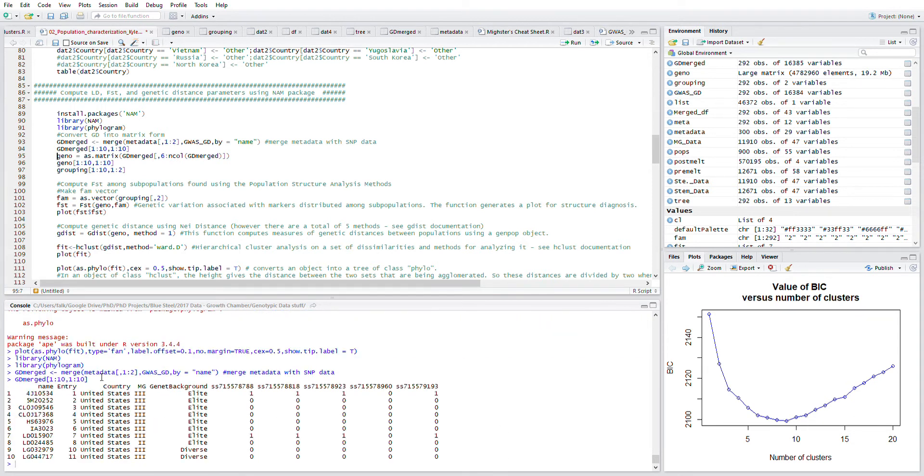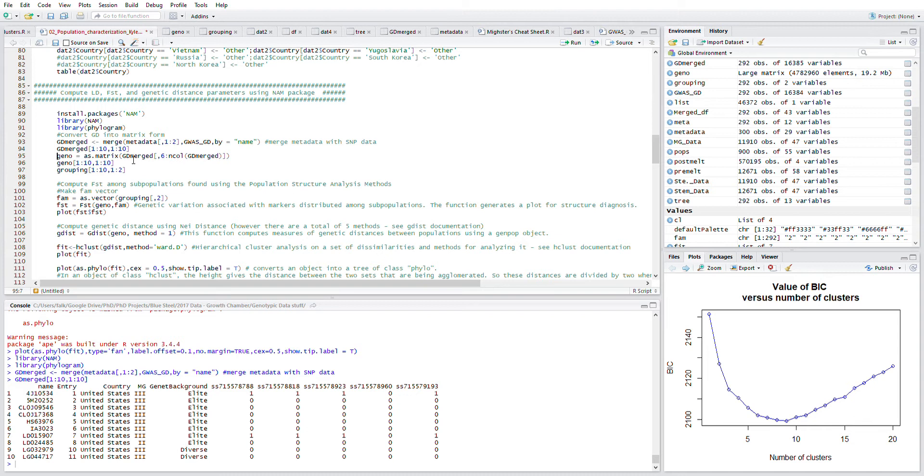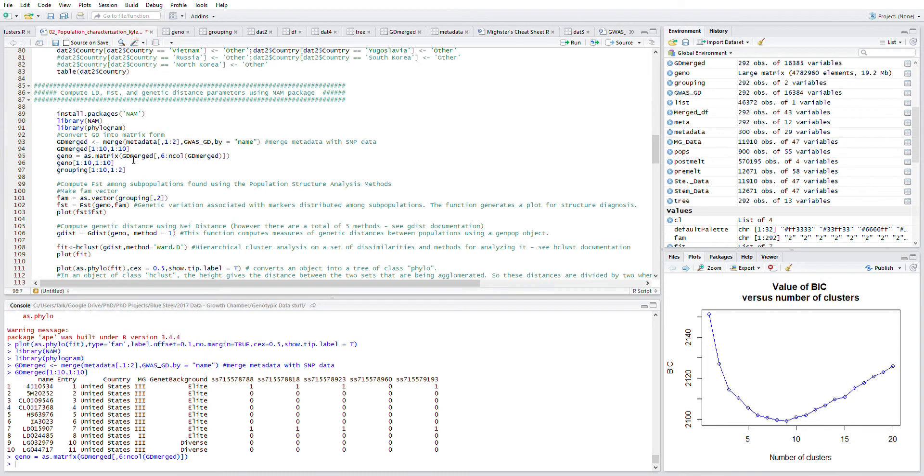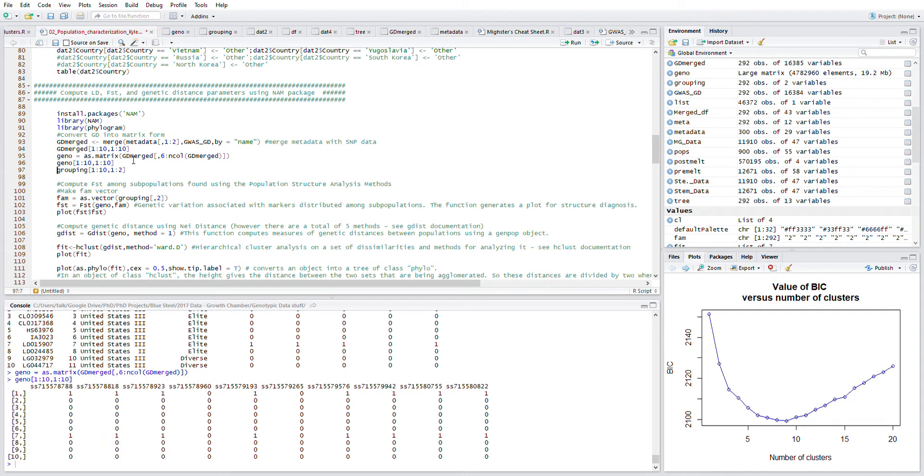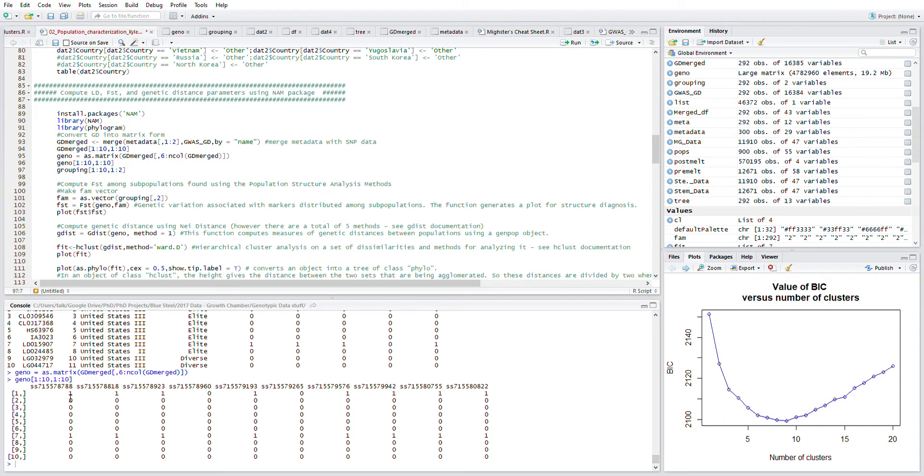We have name, entry number, country, maturity group, genetic background, and then the SNP data from then on. I want to convert that into a matrix but I only want to take the SNP data, so that's what I'm going to do here. I'm looking at just column six and on. Here we have it now, the new matrix that I've created, it's column six and on, so all the SNP data and only the SNP data.